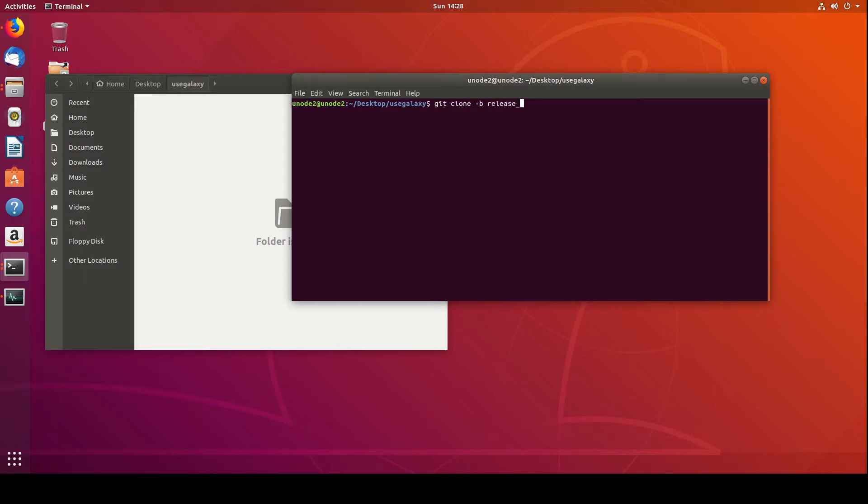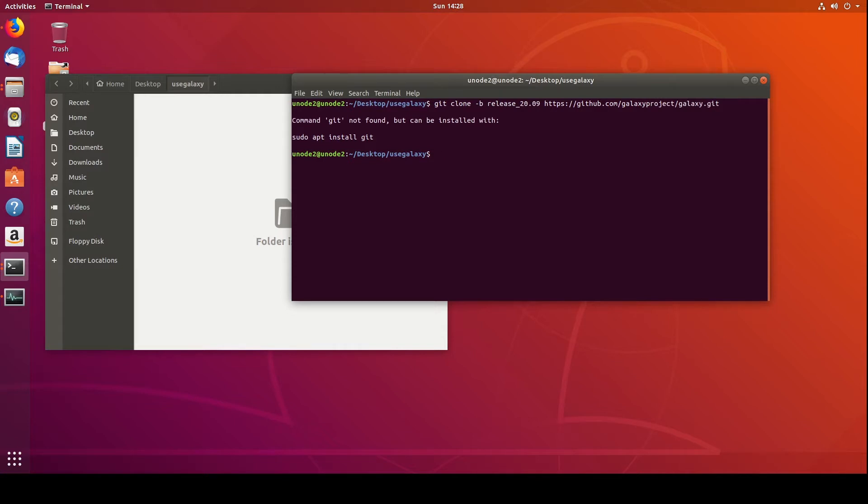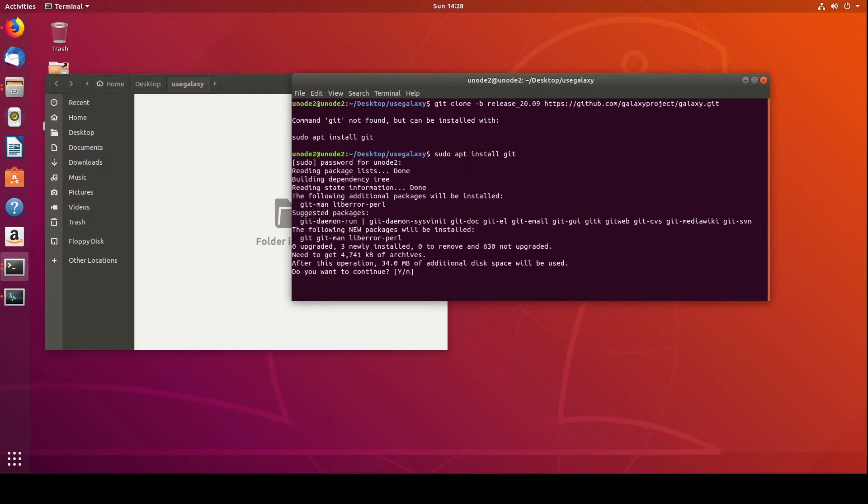But you might have to install GitHub or the git, release_20.09, and then HTTPS://github.com/galaxyproject/galaxy.git. I'm expecting an error. Yep. So sudo apt install git, and then we'll run this. Yes.